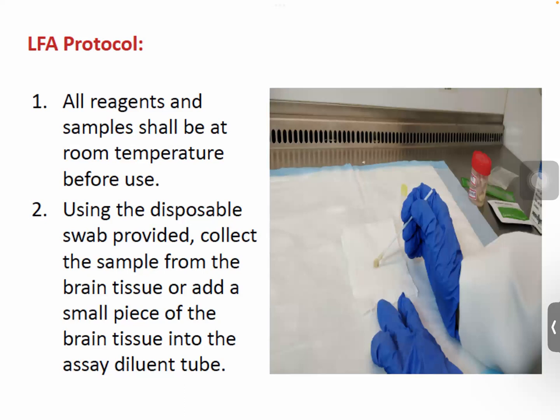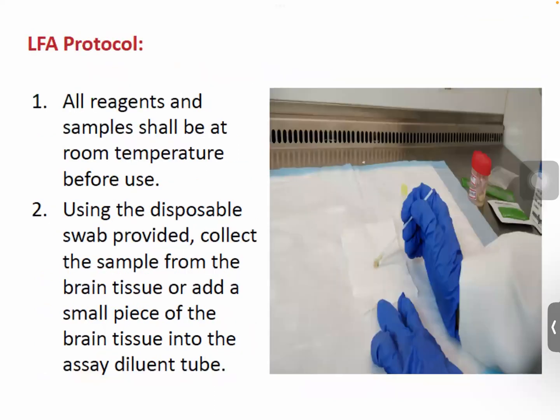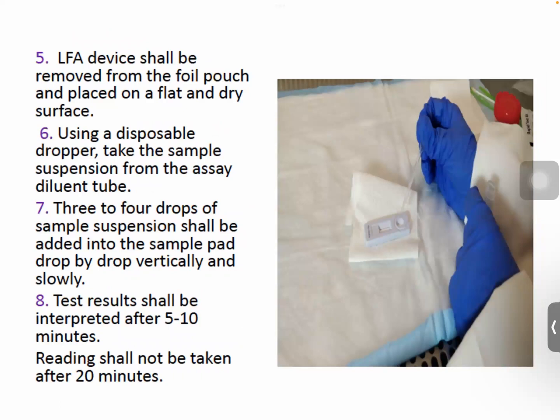So we have to think about the precautions. If you're thinking about food samples, then you have to put the pre-treatment as well. You have to consider pre-treatment in the kits, whether you have simple extraction or simple digestion of the food samples. So these are very important to be considered. These are basically the protocols. I'm not going to discuss this actually.